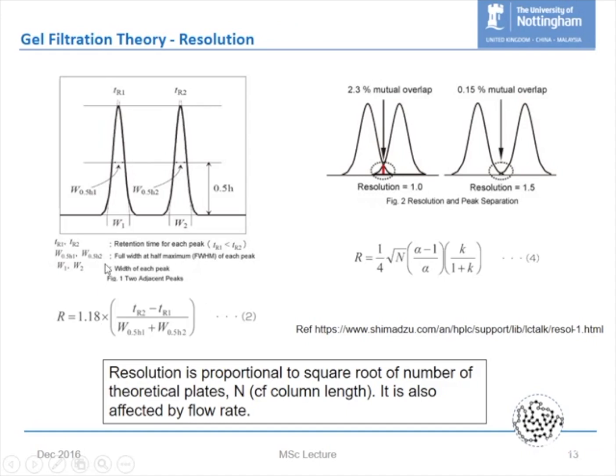We have an equation here which allows us to determine the resolution. In this case we've got pretty much total resolution, a resolution of 1.5.